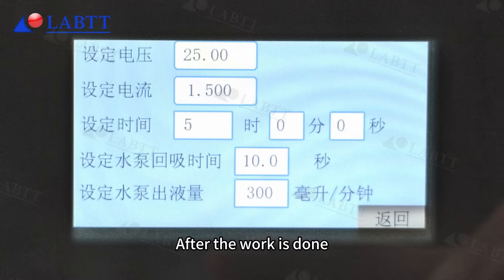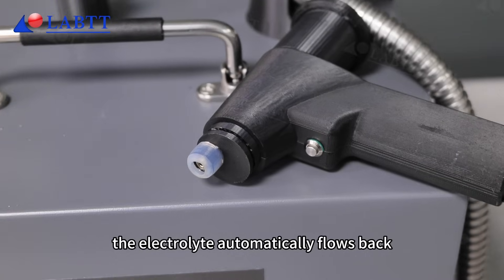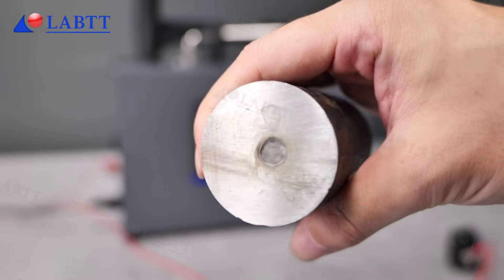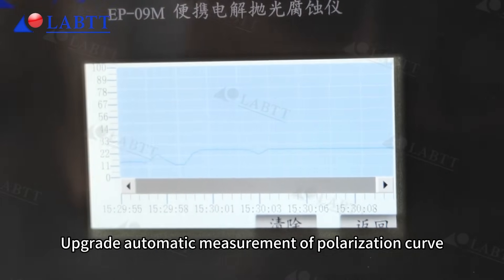After the work is done, the electrolyte automatically flows back. Automatic pipeline cleaning — efficient and worry-free. Upgrade automatic measurement of polarization curve.